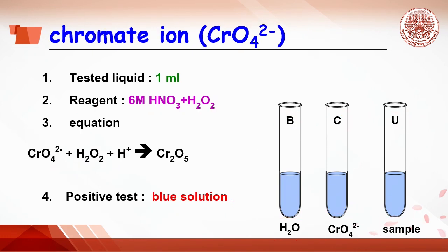Comes to chromate ion test. Do the same by adding water, chromate ion, and sample 20 drops each. Then, add nitric acid and hydrogen peroxide.